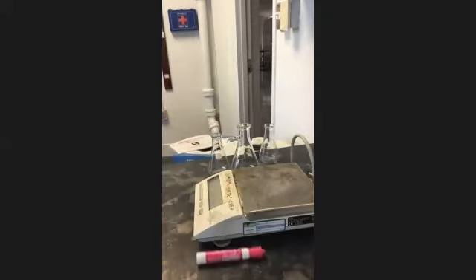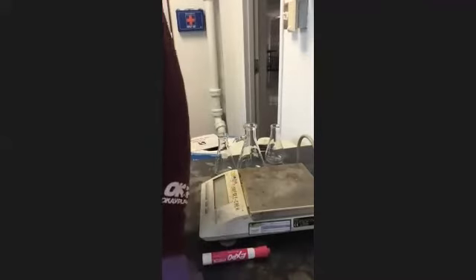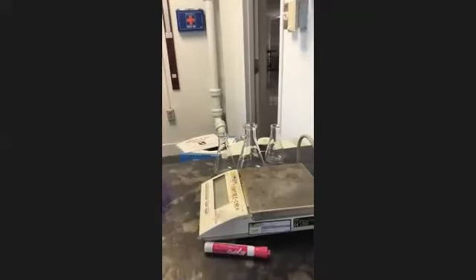All right. So normally, let me see. Make sure y'all can see the balance. Yes, it's raggedy and old, but it's clean. So normally, what we'll do is we'll take a piece of wax paper or a weigh boat, and I actually like doing this better. This is cool. So we'll take a piece of wax paper.